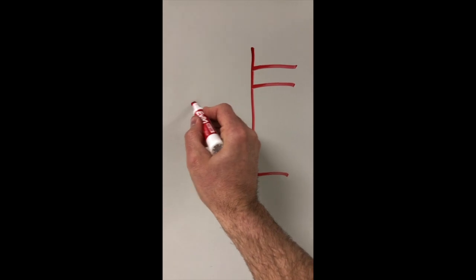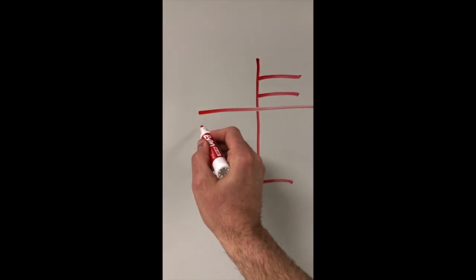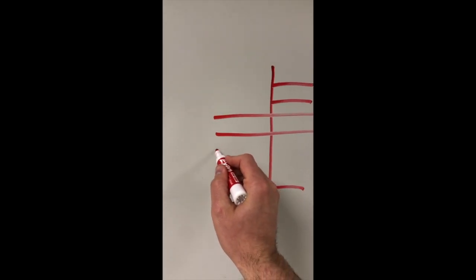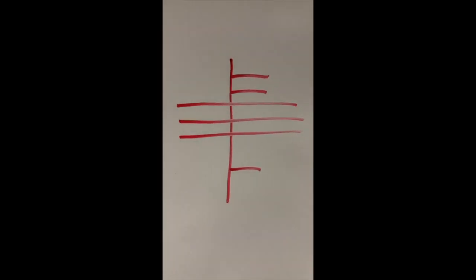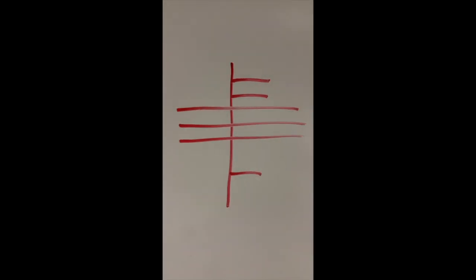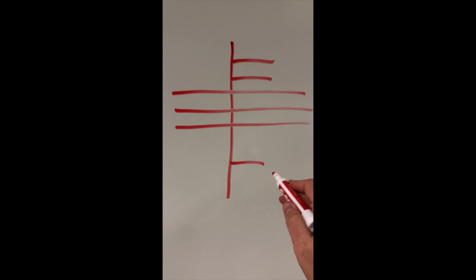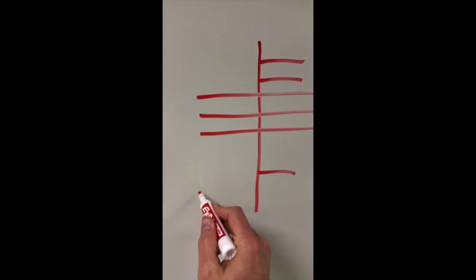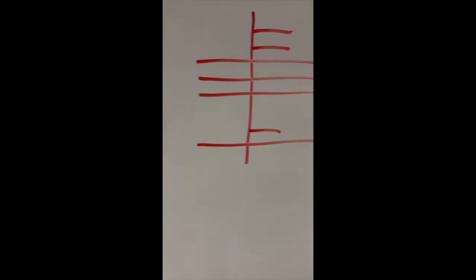So if you can do that and then include the matched ones, you've got the adrenals, you've got the kidneys, and then after that, you've got the ovarian or testicular, the gonadal, spermatic arteries as well. And then you've got down there, you've got the inferior mesenteric artery, and then you've got one more pair of matched arteries. It's the iliolumbar.